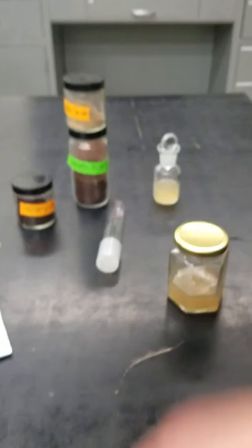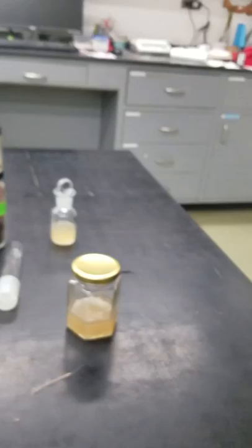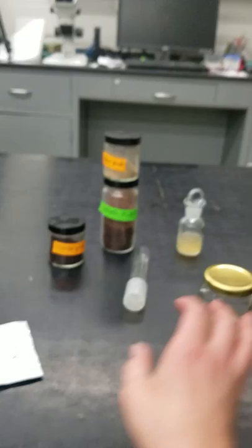I just found the laminar flow hood too much of a hassle to work with. I like the glove box better because once you have everything in there and it's all sprayed down from the inside, that area is sealed and there's no way for any materials to enter from the outside world. With a laminar flow hood, you have materials entering — the concept is that the push of sterile air is enough to keep things out, but you have to have a good amount of practice. I have found I get far less contamination if I use my glove box. I do get some criticism for the glove box because it reduces how much you can do at once, but that's just something you have to play around with.